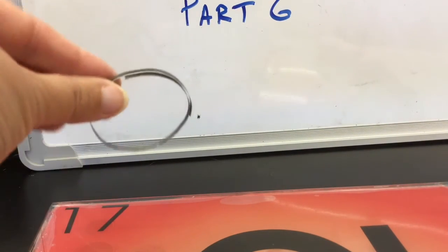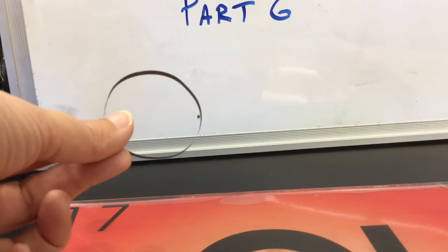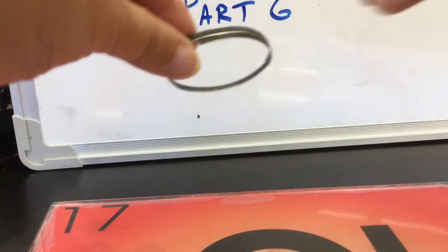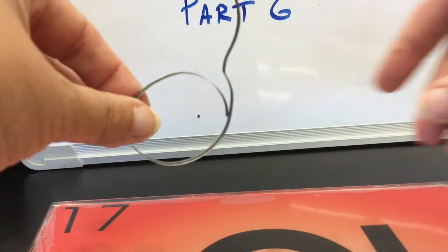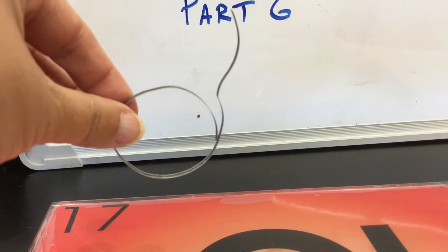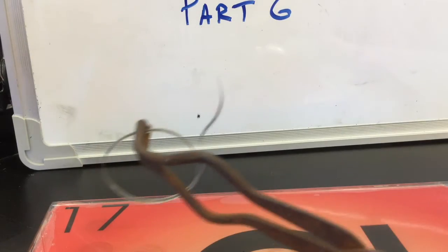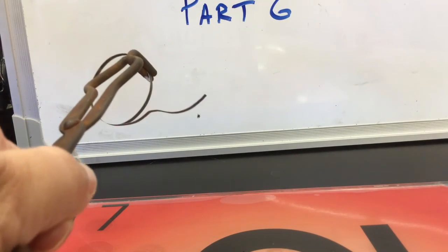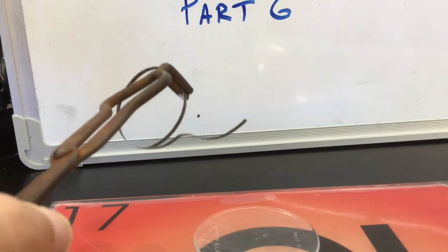Be sure to observe the magnesium before you light it so that you can compare and contrast with the residue after you light it. You may wish to uncoil it a little bit and bend it backwards so that you are only lighting one end of it. Grasp the coil in your crucible tongs and light one end. Hold this over the watch glass.